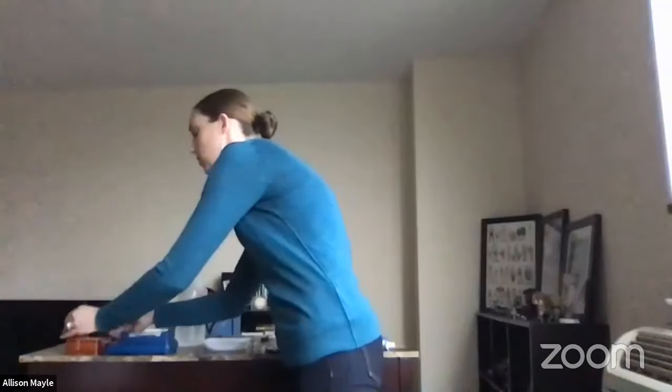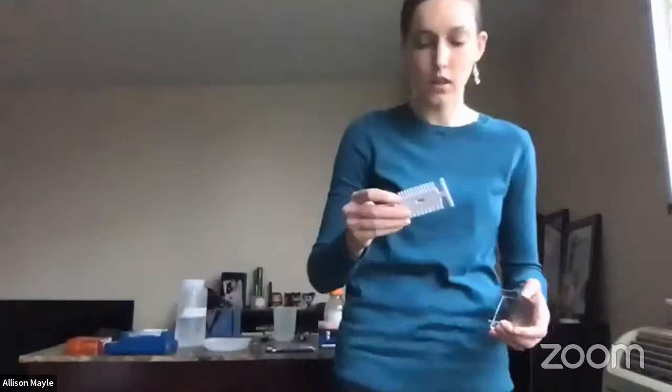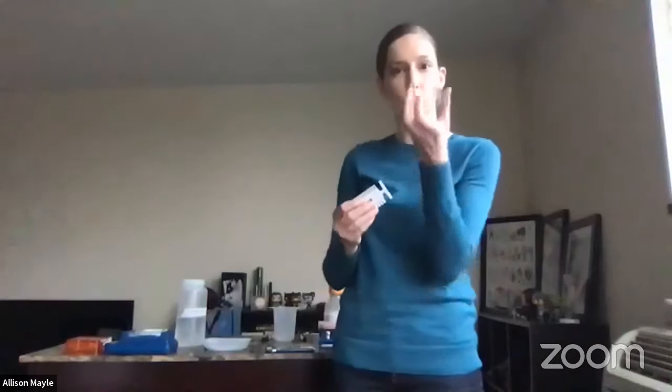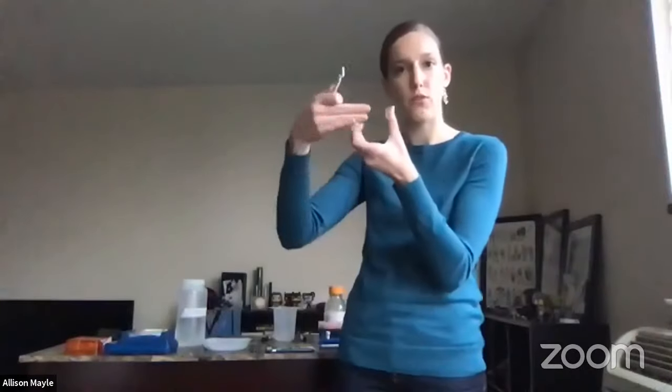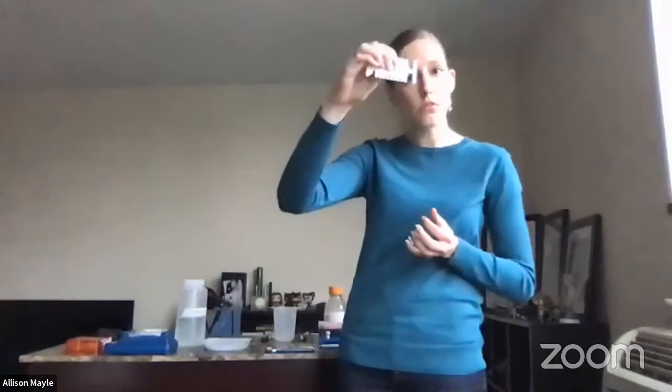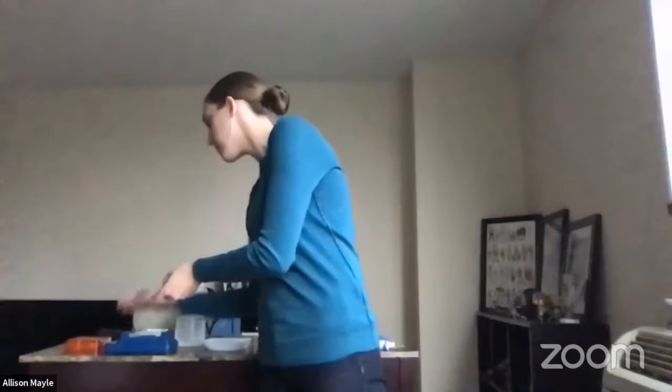because when we put our gel together, we use this thing called a comb because it looks like a comb that you would use for your hair. It has these little teeth. And as the gel solidified, so it's just like making Jell-O, I heated up the agarose and poured it into this little mold. It had something on the end before to stop the gel from running out of the ends. And I put this little comb on it so that anywhere there's a tooth in the comb, the gel would leave a little indentation, a little pocket.